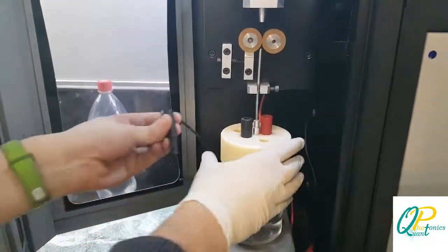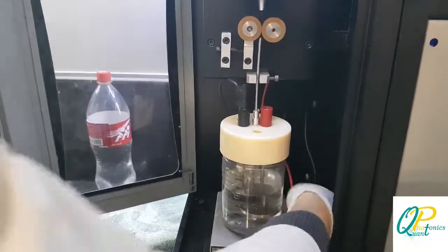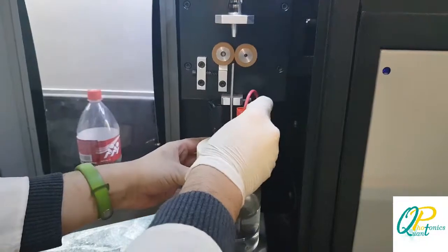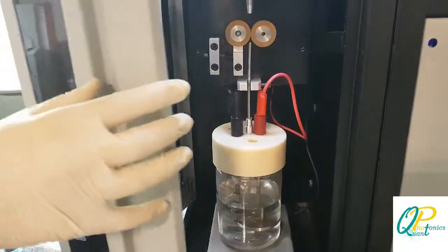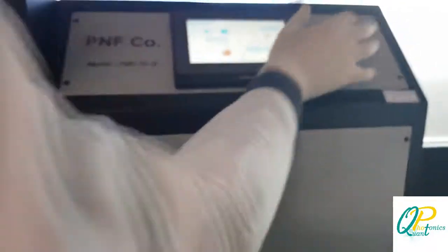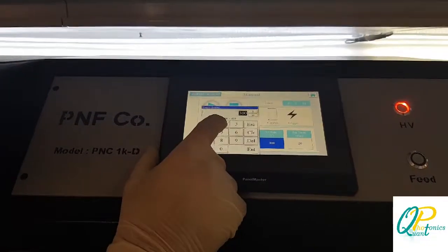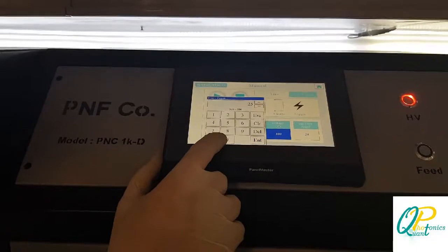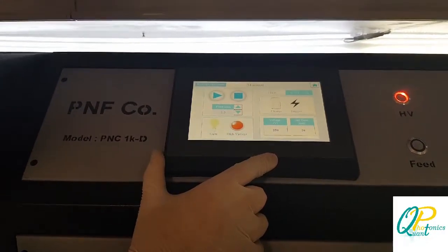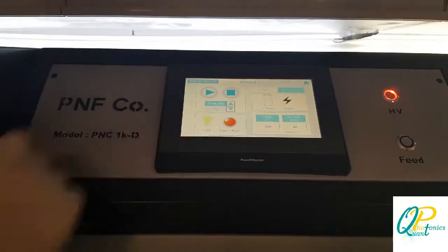Now, with the container fixed, we have to attach the contacts to apply the high voltage we want. We can close the door of the device, and by setting the voltage, time, and feed rate, we can perform the experiment. The voltage is set to 250 volts, we keep the time at 20 minutes, and the feed rate at 2.3 cm.